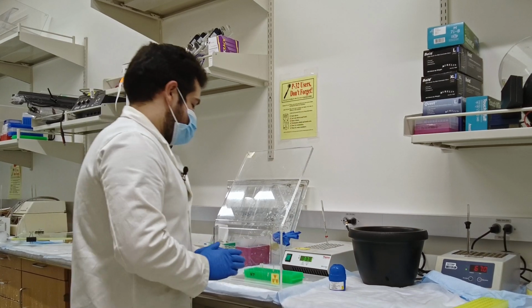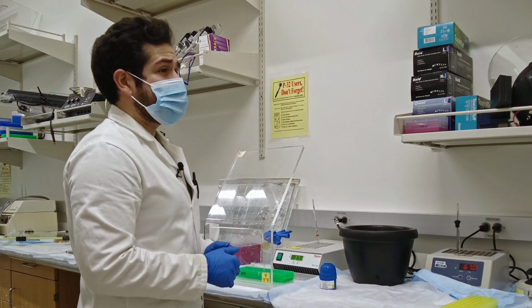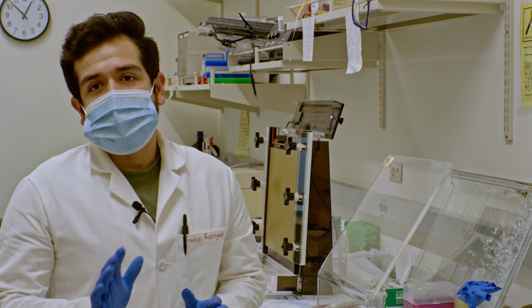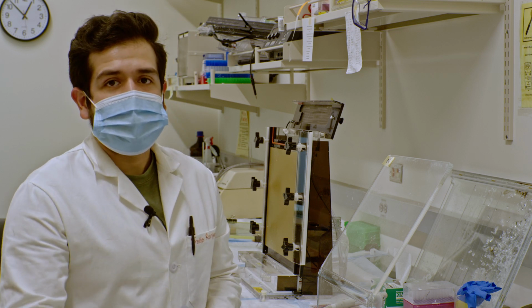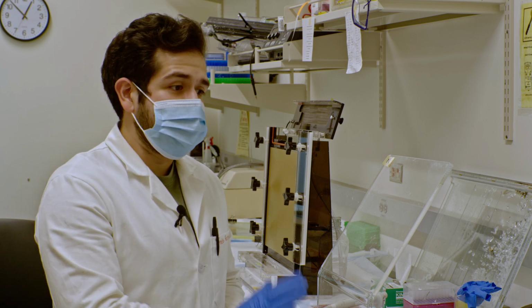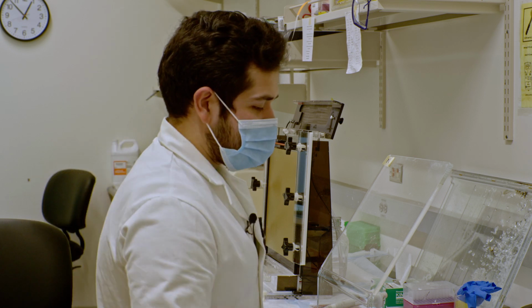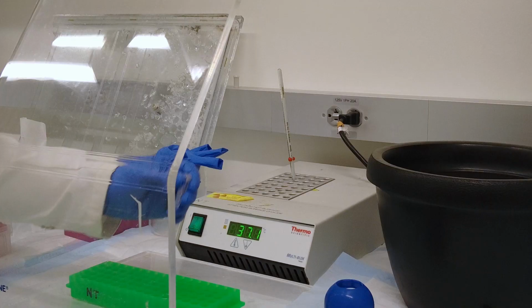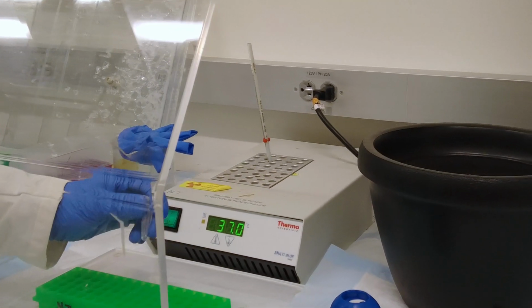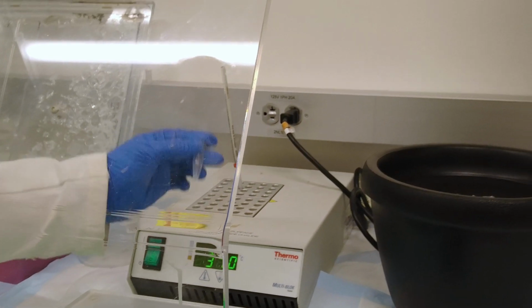You'll want to let this come to room temperature. It takes a few minutes for it to defrost, anywhere from about 10 to 15. But the actual vial containing the radioactive ATP is found within this blue container. From there, all you have to do is take 1 microliter again of this radioactive ATP and introduce it to your primer that you'll want to radiolabel that contains T4 PNK and T4 PNK buffer. T4 PNK and the T4 PNK buffer can be purchased from New England Biolabs, which is what our lab has done in the past. But once you've added your radioactive ATP, again 1 microliter, which is 25 microcurie, into your solution, you should have 20 microliters overall volume in this solution that will radiolabel your primer.